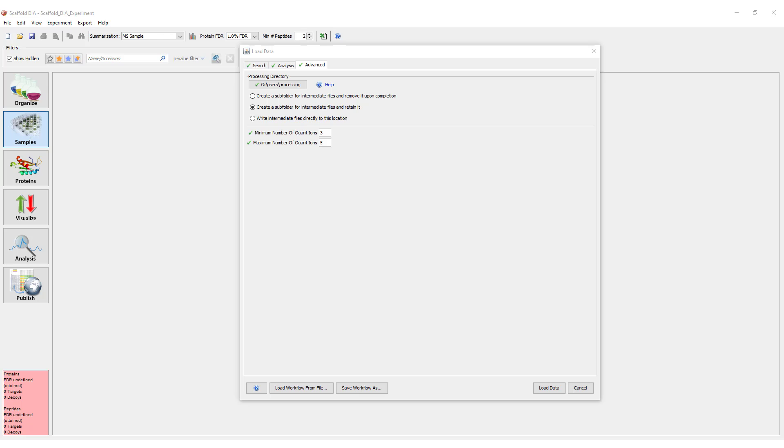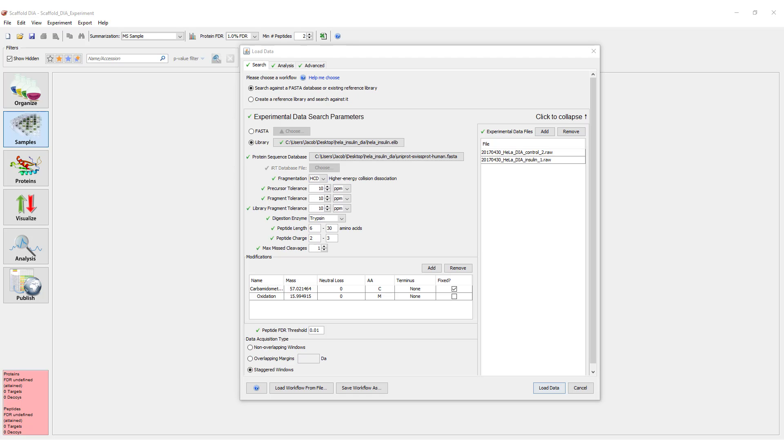Lastly in the Advanced tab, you can configure the minimum and maximum number of quantified ions for a peptide. Quantification is done by fragment ion intensities in Scaffold DIA. Setting the minimum allows you to require multiple fragments to avoid quantifying on just one or two. Setting the maximum saves time by not quantifying extraneous ions.